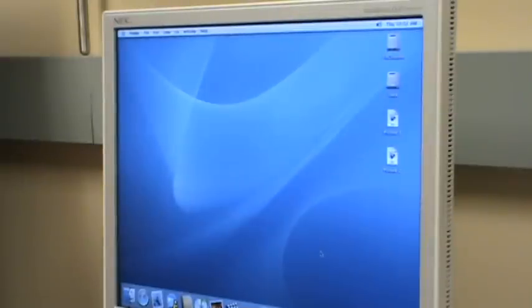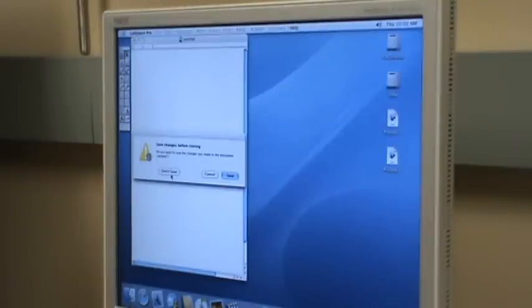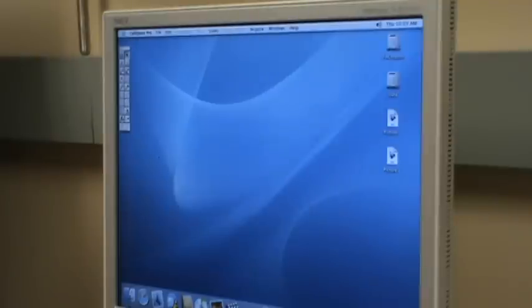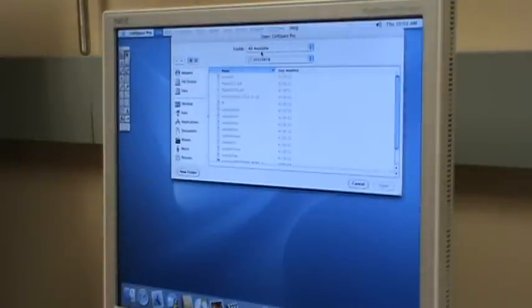So at the bottom of the screen, there's a CellQuest. That's a software we want to use. Once you open CellQuest, it gives you an empty document. We don't want to use that, we already have a template. So I'm going to go to File, Open Document.